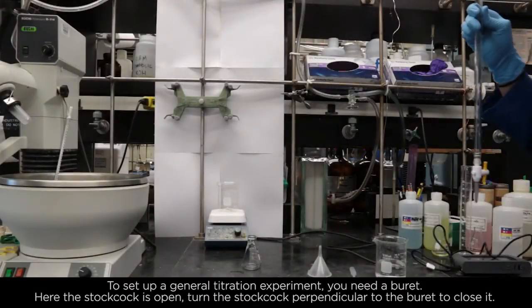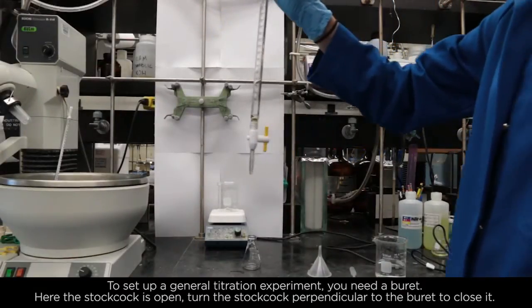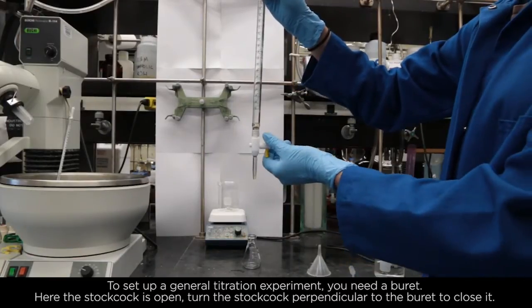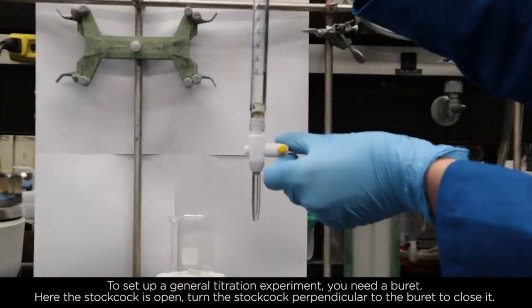To set up a general titration experiment, you need a burette. Here, the stopcock is open. Turn the stopcock perpendicular to the burette to close it.